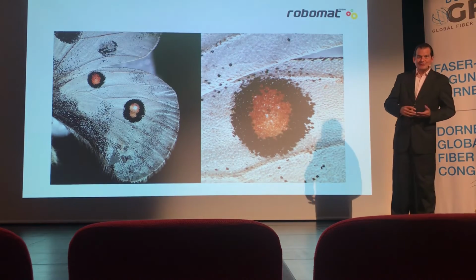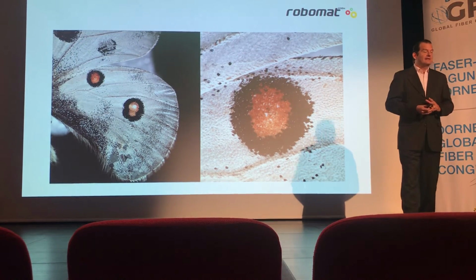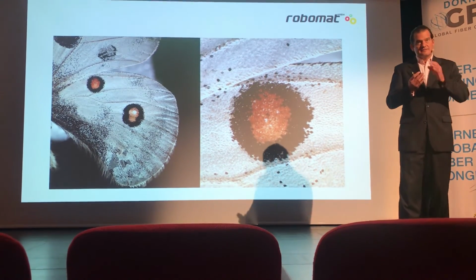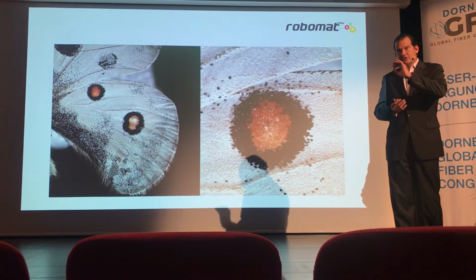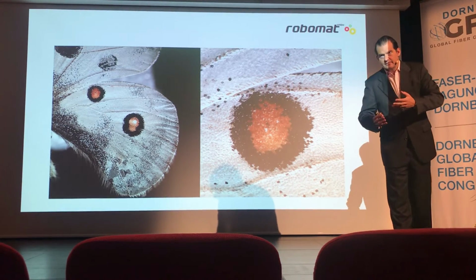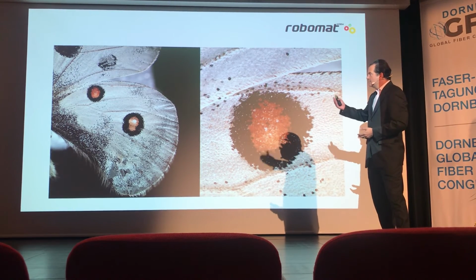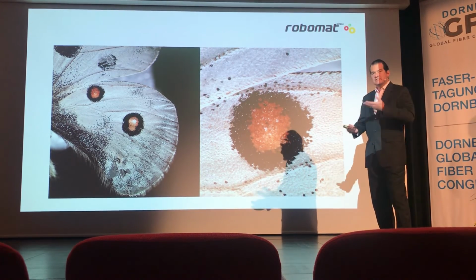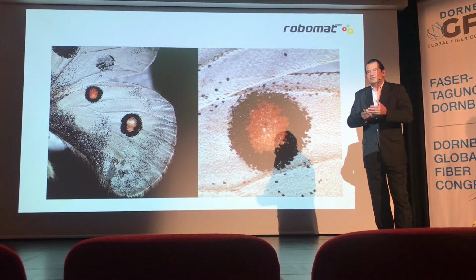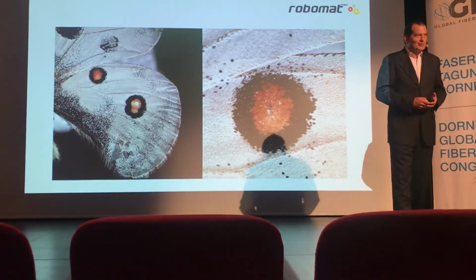We had an interesting project for butterflies, where, of course, you will understand with regards to the optics, that when you have this, you have a very short expanse, so you have a very low depth of focus. So here we had to do stacking, so you're taking 50 pictures and stacking them together, unifying them to get one picture that has very nice focus. In this case, it was for a collection of butterflies.